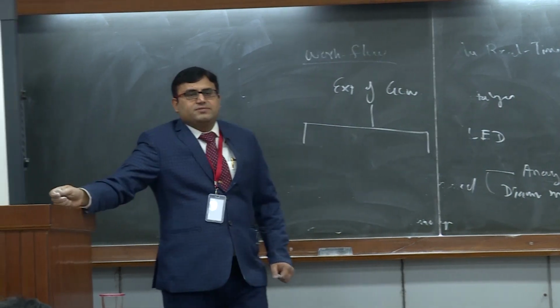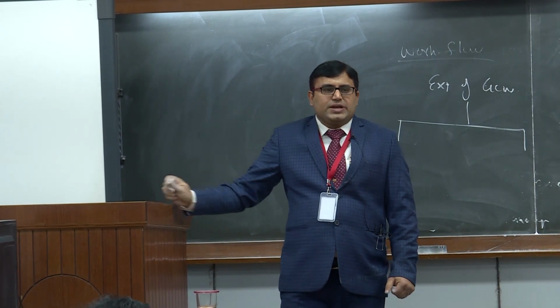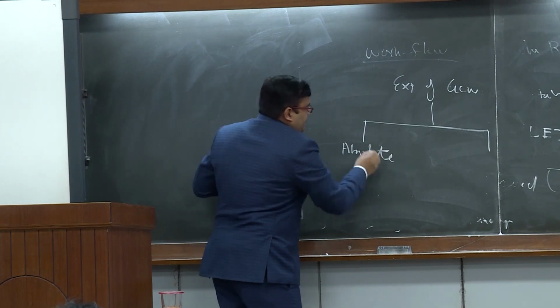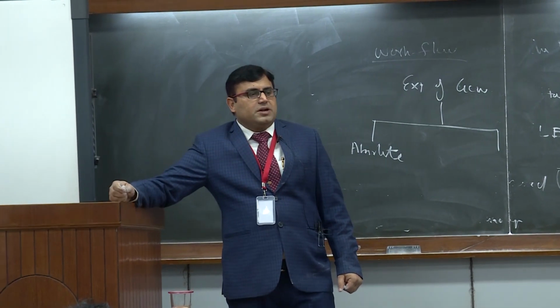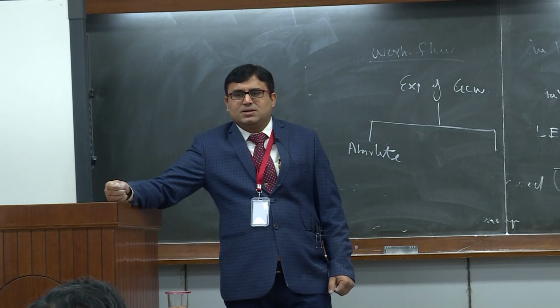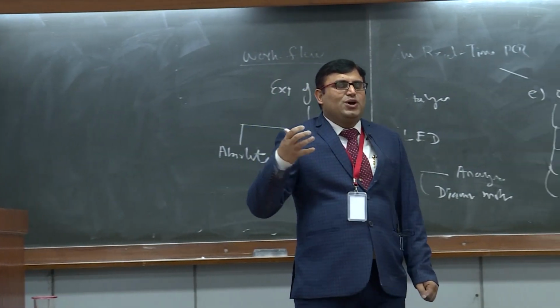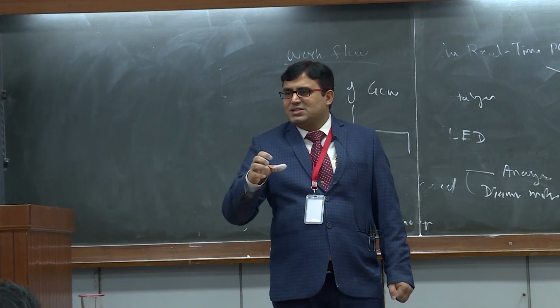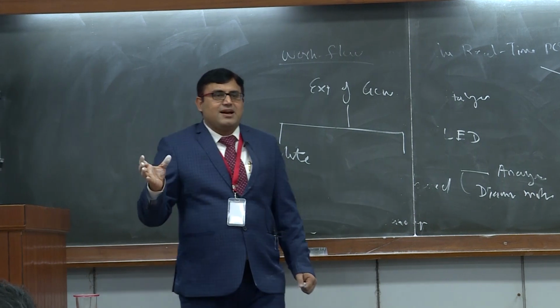So basically we have three different types of expression. The first type is called absolute expression. Absolute expression means, how many of you have done the Bradford method or Lowry method? What we used to do is, you have a known OD and then you plot the unknown OD onto the standard and it will give you the concentration. So in case of absolute, we have a standard graph.